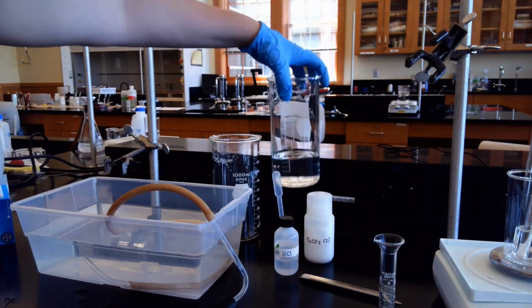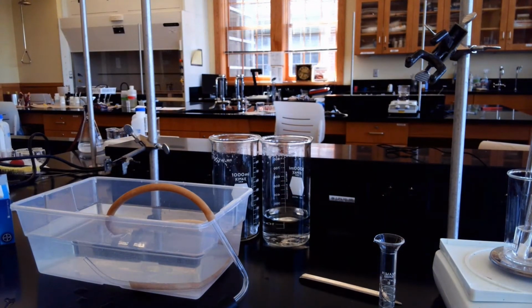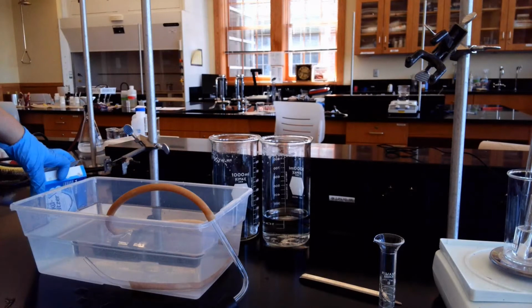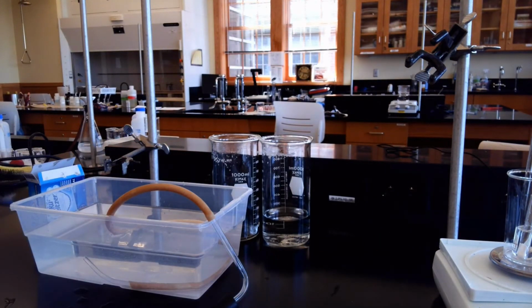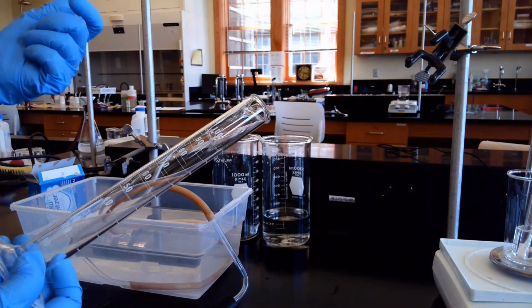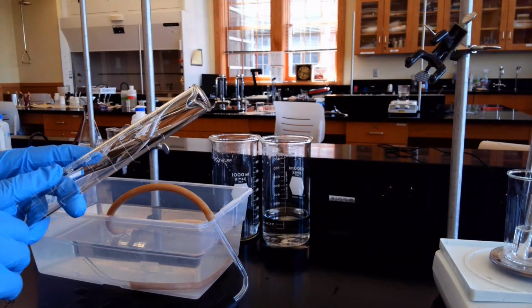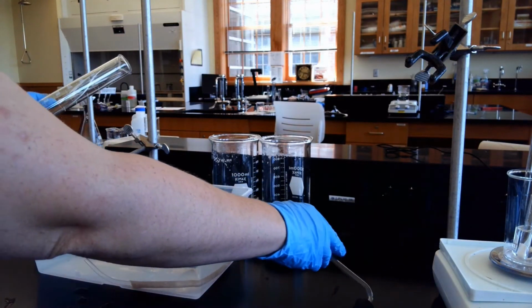And the Alka-Seltzer produces carbon dioxide. Let me move these out of the way. Here's our box of Alka-Seltzer. And that saturates the water with carbon dioxide. So what we're going to do now is we're actually going to use a bit of a larger graduated cylinder than it calls for, just to make sure if we do produce more gas, we don't run out of space. So we have to fill this completely with water and tip it upside down so there's no bubbles.